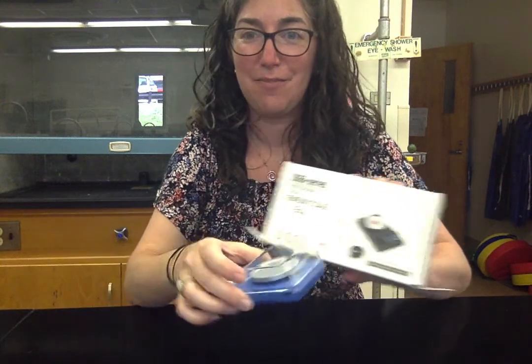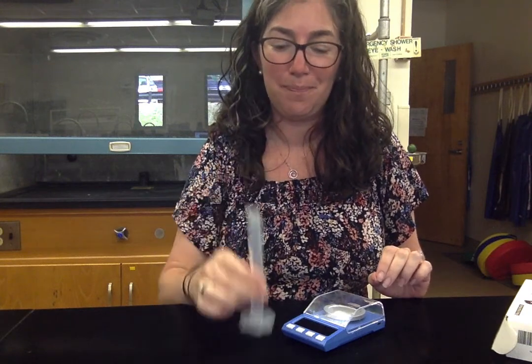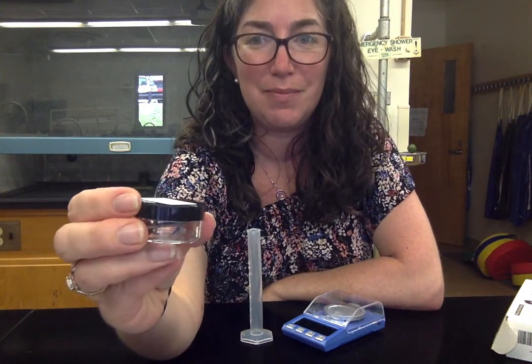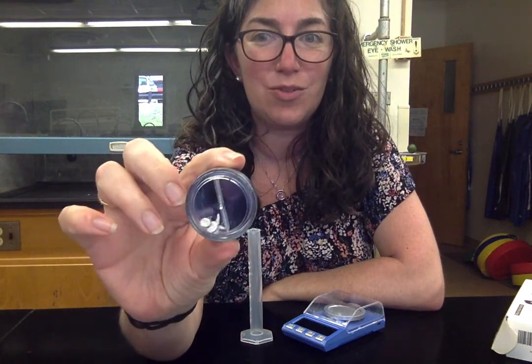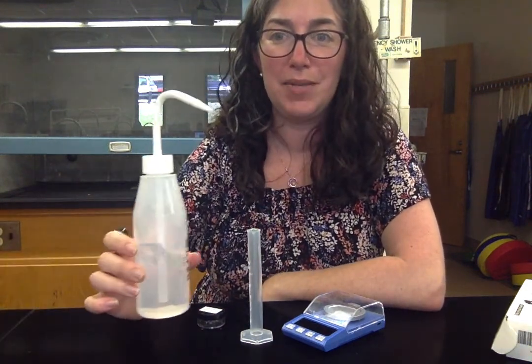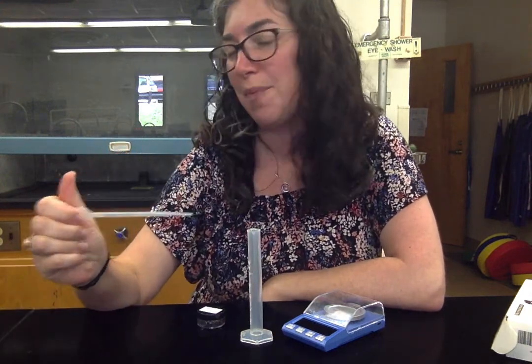Welcome to the demonstration video for the density and measurement lab. From your lab kit you will need your digital scale. You will also need the 10 milliliter graduated cylinder, which is very small. You will need the metal nails, which are in a little cosmetic jar — there's one large one and six small ones. You will also need some water and you may or may not want your little dropper.